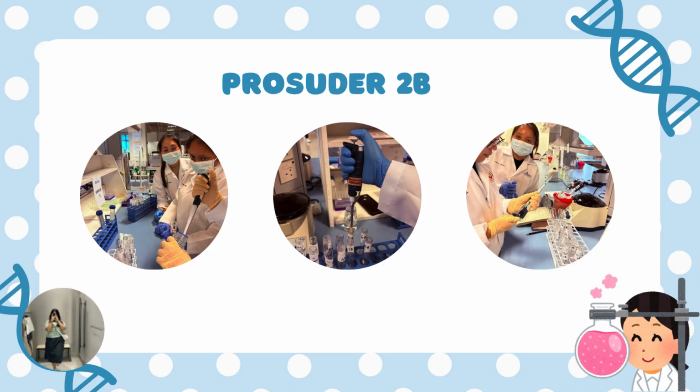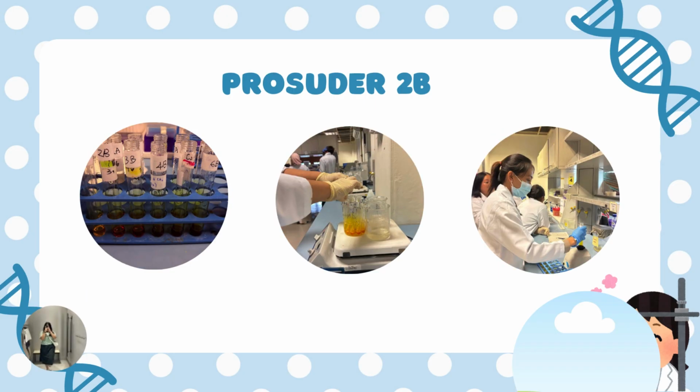Next, we put a glucose solution into each of the test tubes using a 1000 microliter micropipette. After we transfer all of the solution into the labeled tubes, all of the test tubes were mixed using a vortex mixer. After all mixed well, we place all of the tubes into a hot beaker of boiling water for 5 to 7 minutes.